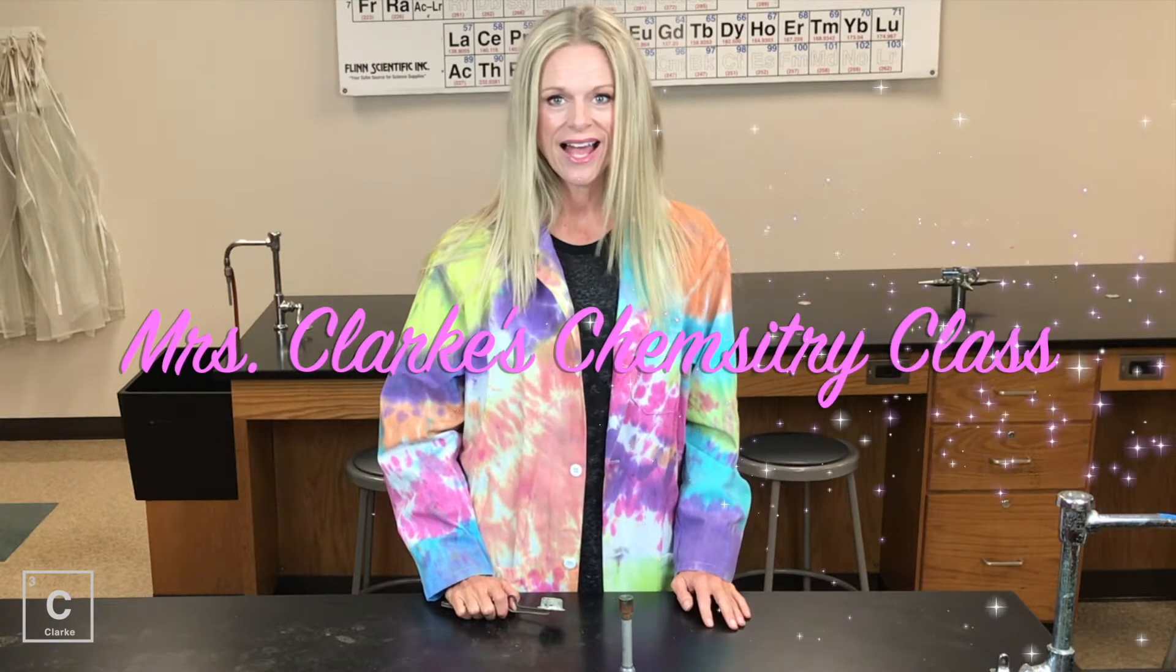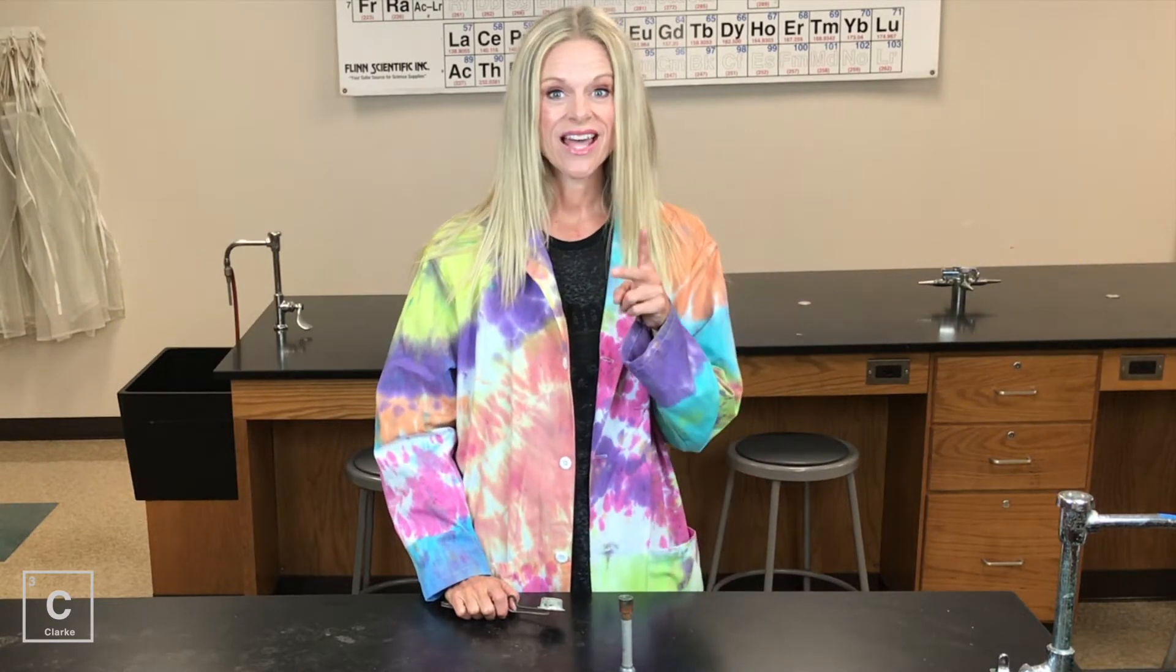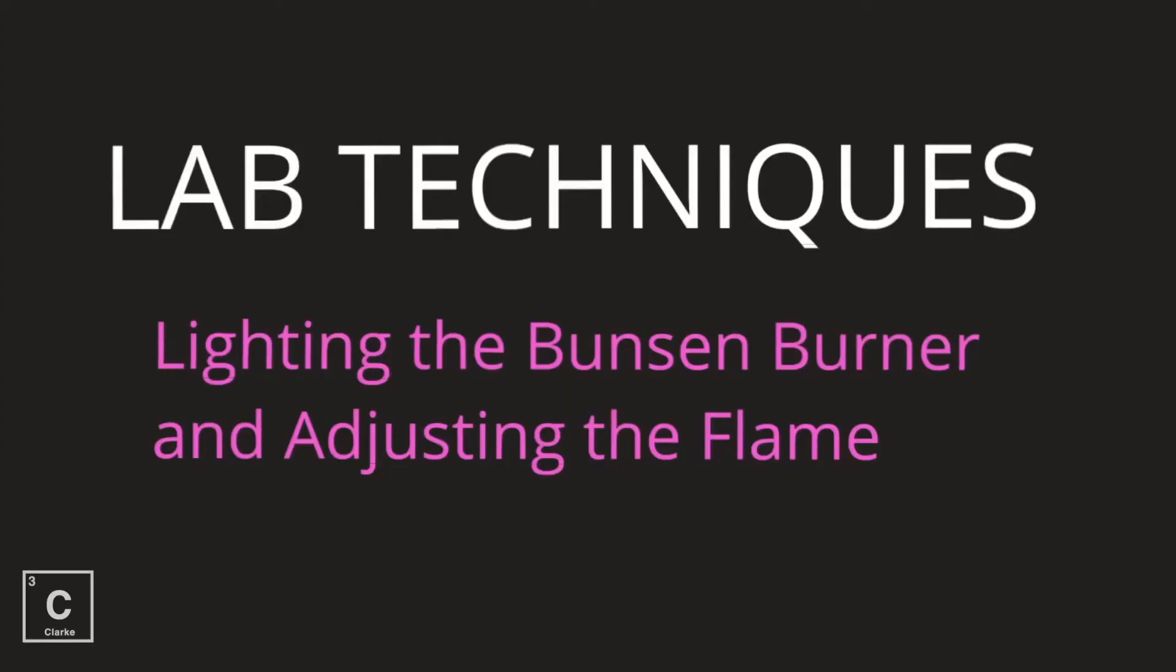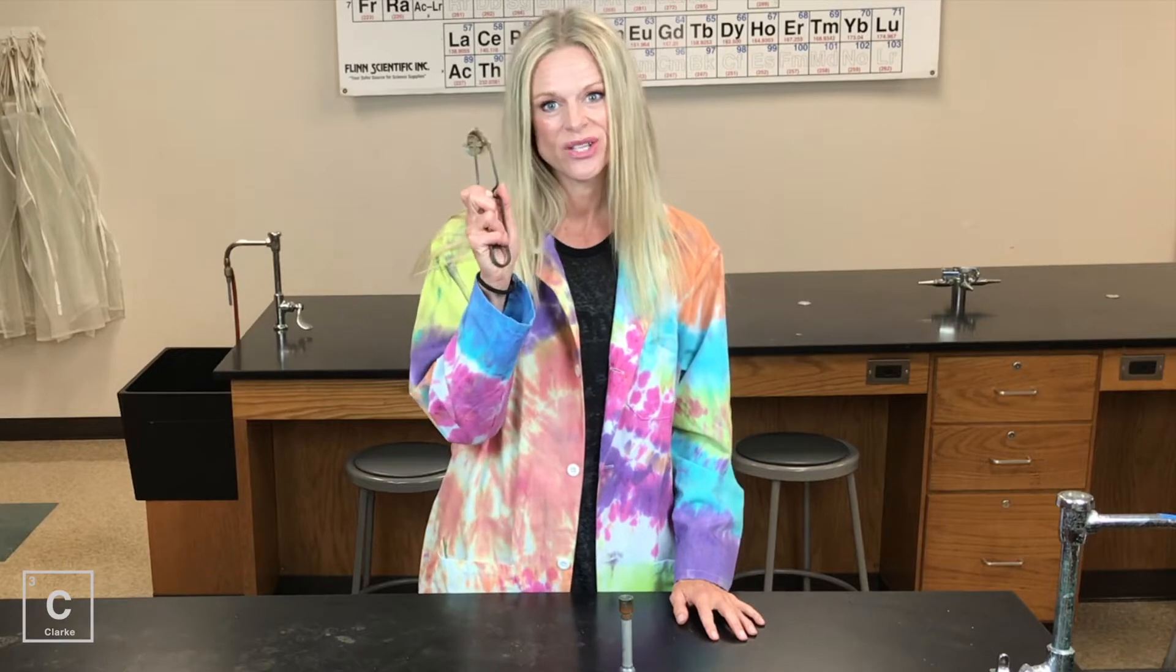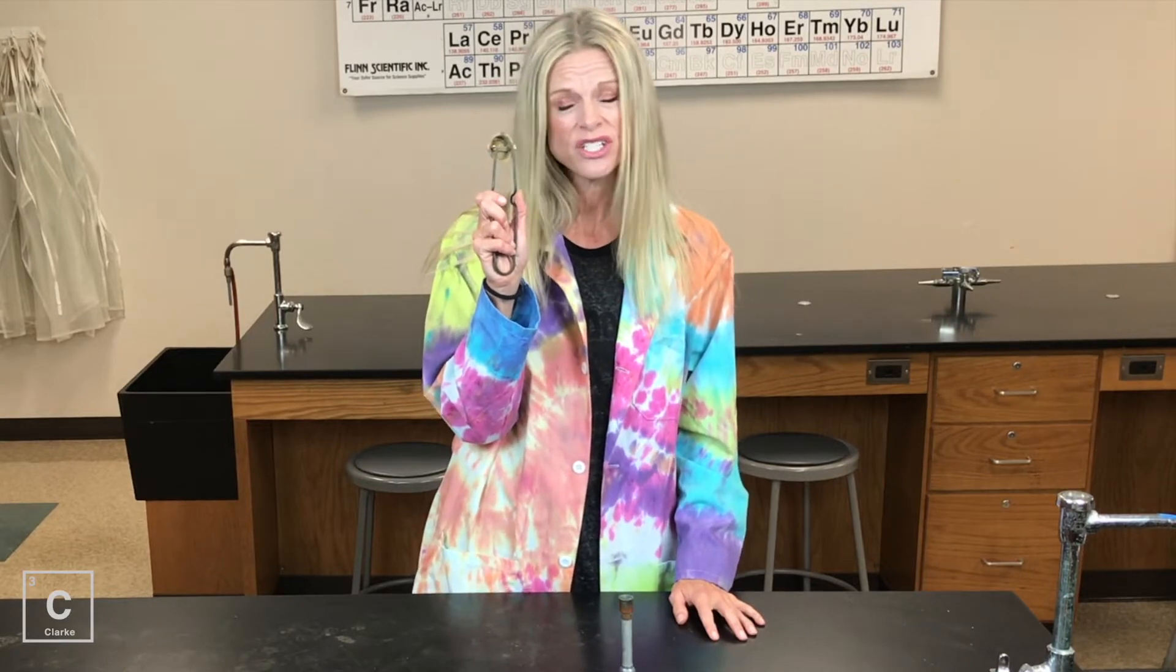Hey y'all, welcome to Ms. Clark's chemistry class. I've got the second video for lab procedures. In this lesson, I'm going to teach you how to light the Bunsen burner. We're going to use a striker. We're not going to use matches or a lighter.